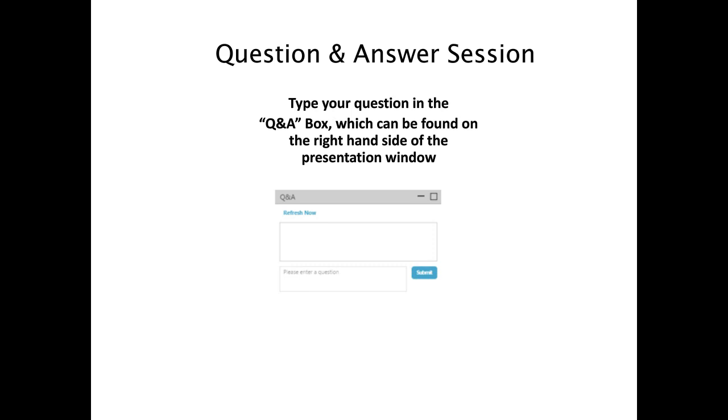Our next question is, what's the optimal data acquisition rate on a DAD? That is, how many data points across a peak? And also, what is the optimal bandwidth? 214 plus or minus what bandwidth?